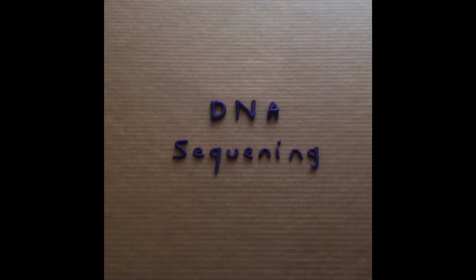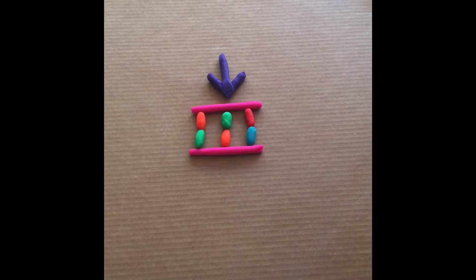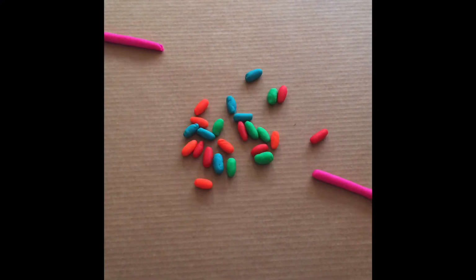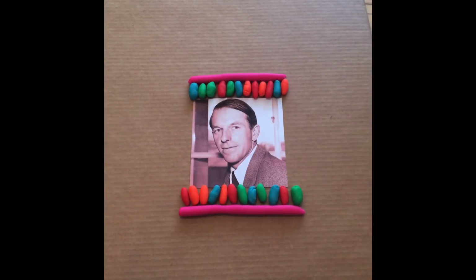Discovering how base pair changes affect protein formation was a huge part of understanding protein synthesis. For example, the difference between a sickle and normal red blood cell is only one nucleotide. However, early DNA scientists had no way of knowing the exact sequence they were studying, only the percent composition. However, in 1975, Nobel laureate Frederick Sanger developed an incredible method for determining this sequence.